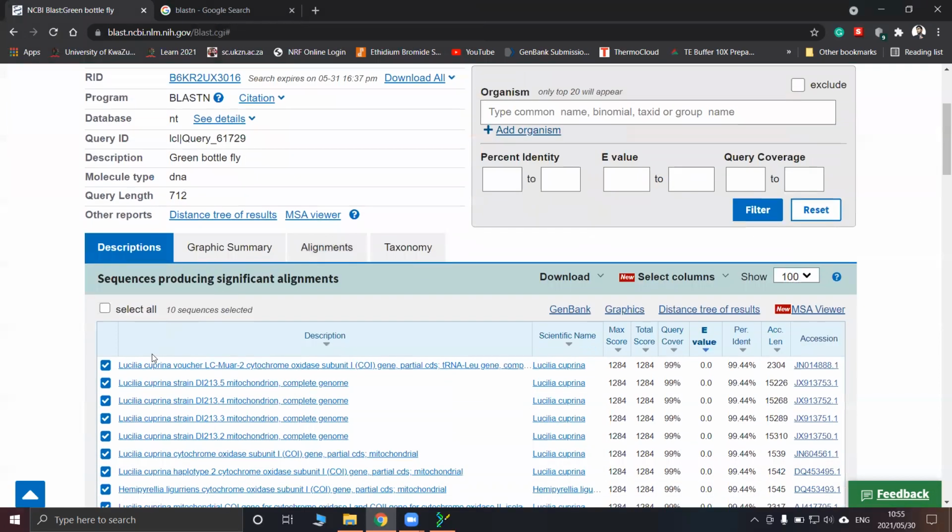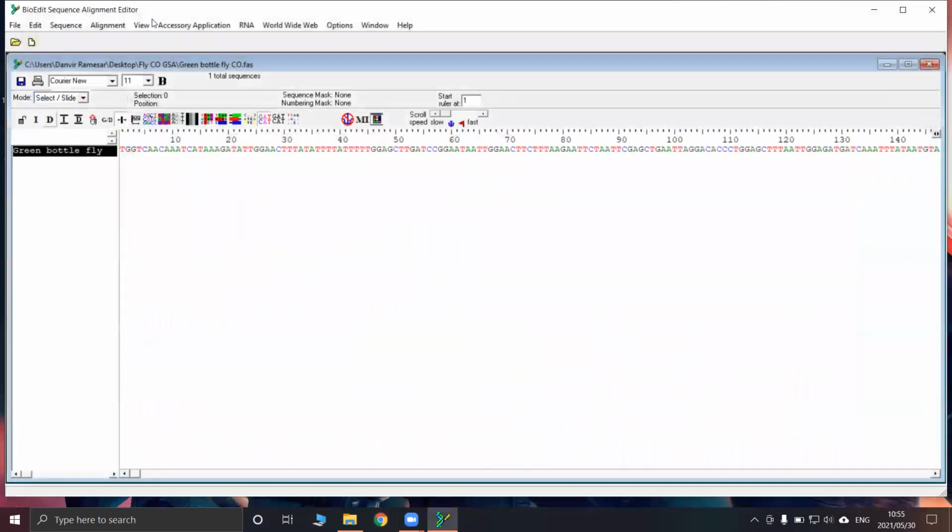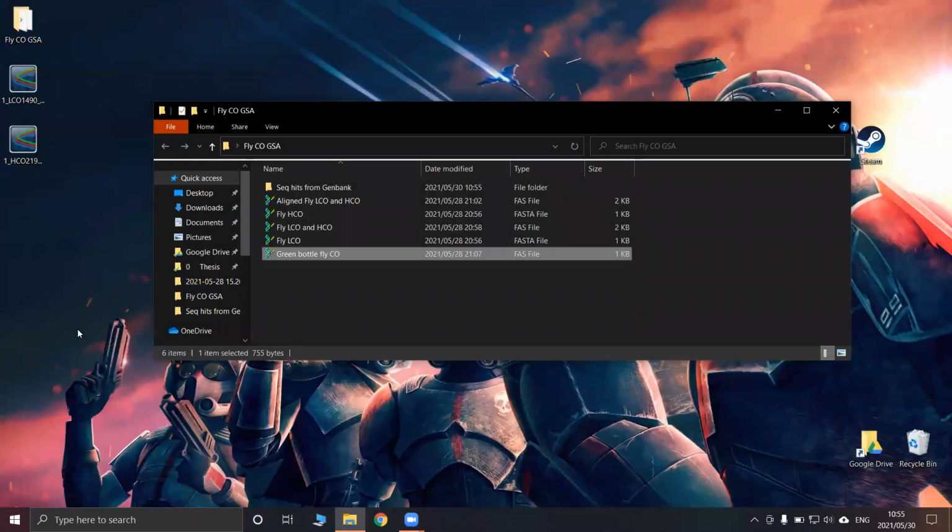Once we have downloaded the sequences that our sequence corresponds to and the description of what the hits are, we do not need to work with GenBank any longer. We can close our web browser, and we can close BioEdit, where our consensus sequence was.